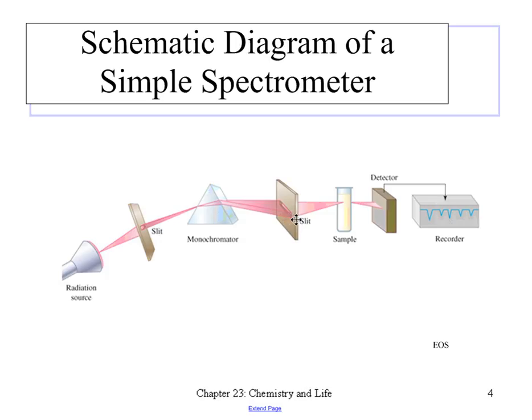So we go through a second slit, and then it goes through the sample and a detector. Only certain wavelengths can cause changes, and that's what we're going to measure. That's what we call something that is quantized. So possibly something at 450 nanometers will cause a change, but something at 470 nanometers won't cause a change.